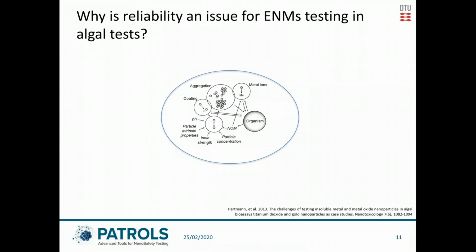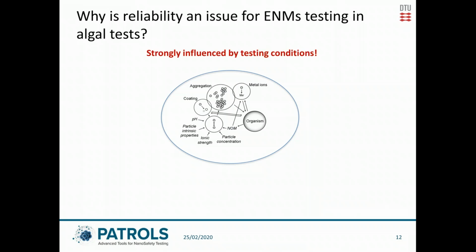We also focus on that. But for our test development, we have realized, and this is not genius, it's just a fact, that all of these processes are strongly influenced by the testing conditions. Algae tests have a reputation for being one of the most difficult, if not the most difficult, of the standardized tests to actually get to behave properly.